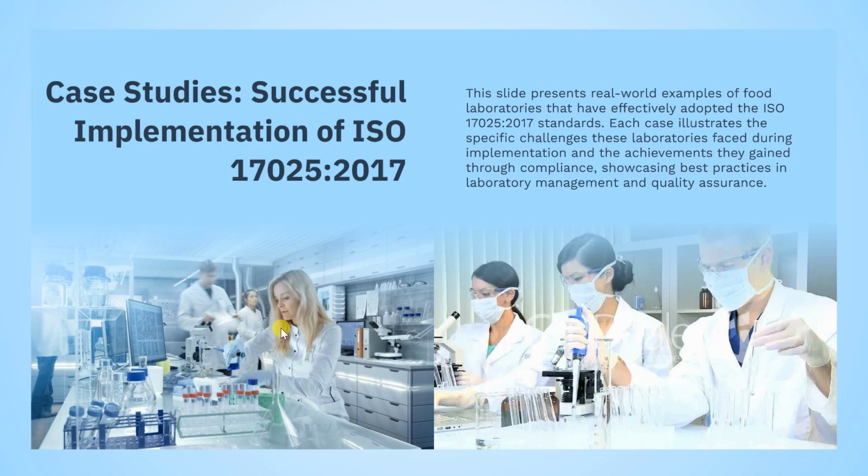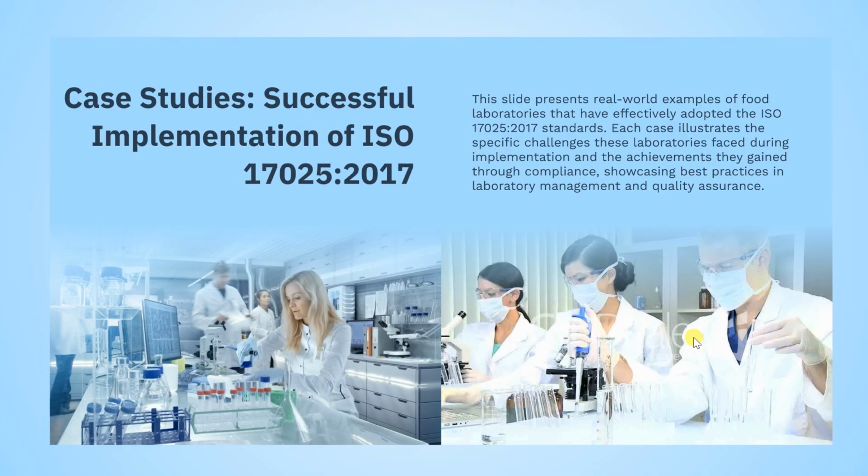Look at the previous, before training or before implementation of this ISO 17025. No nose mask. They were just rushing. No one is focusing on his or her job or duties. But now you see that the quality has risen.